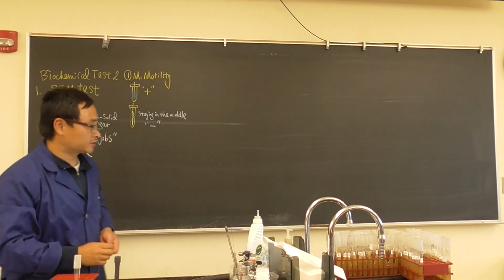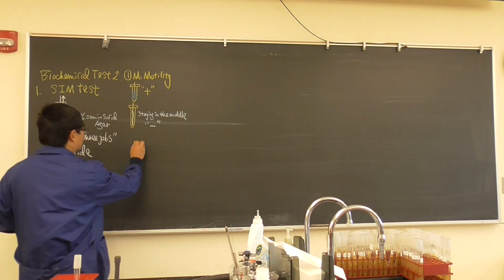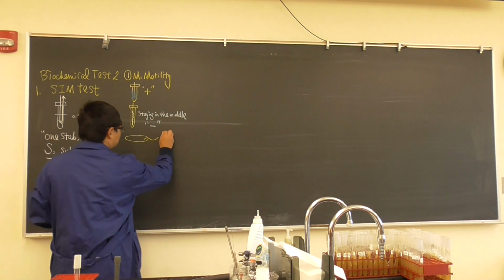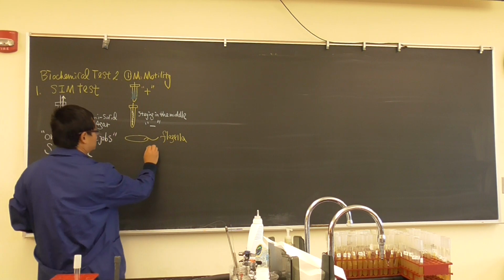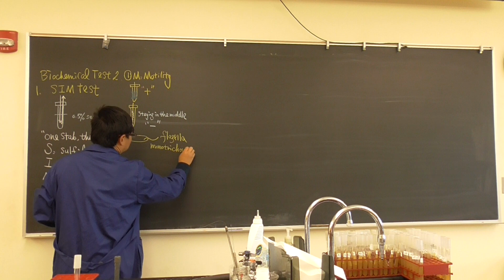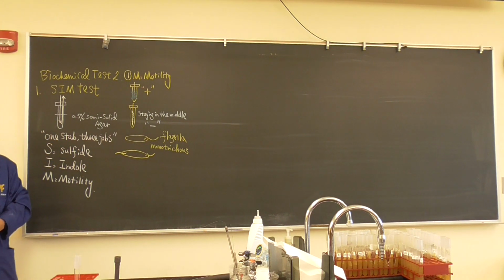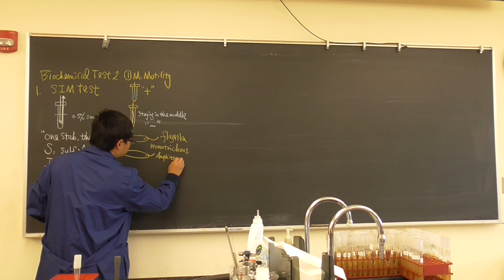Now, how do we know if bacteria have a strong motility or not? We base it on these results, and also, if you still remember, on the location and the morphology of the flagella. So if you have only 1 at the end, we call it monotrichous. If you have 1 at each end, what do we call it? Amphitrichous.